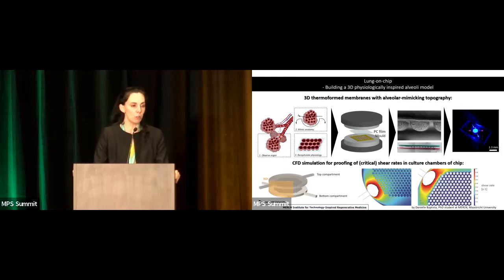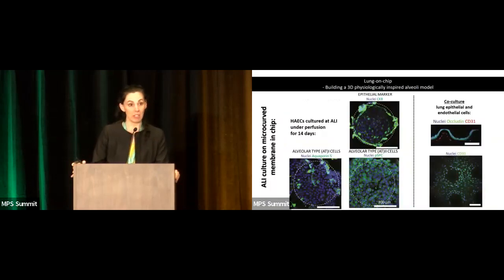So we addressed also the perfusion to guarantee that the flow would not affect the cell seeding. And all the cells were uniformly distributed throughout these kind of membranal structures. So with this, we recreated a, let's say, 2.5D or 3D, as we can call it. And we seeded primary cells, human primary cells. And again, what we wanted to see was whether we could mature these cells to the different phenotypes we wanted. So we wanted alveolar type 1 cells as well as type 2.